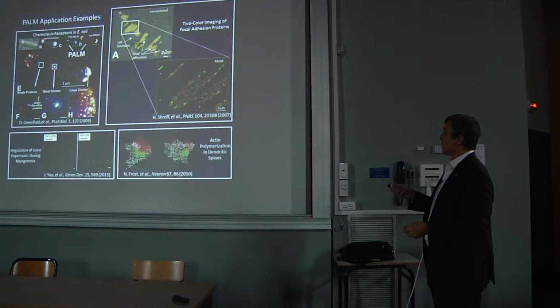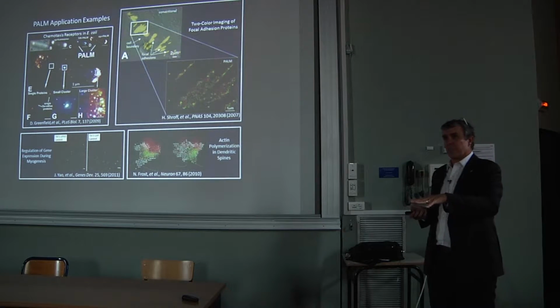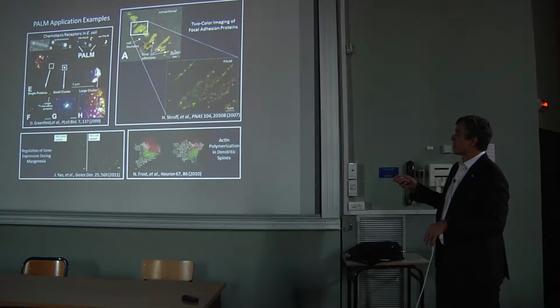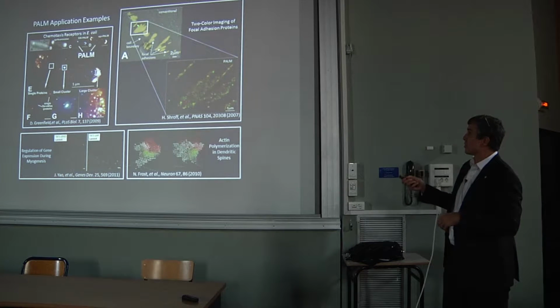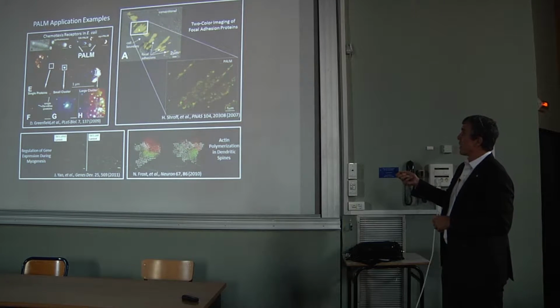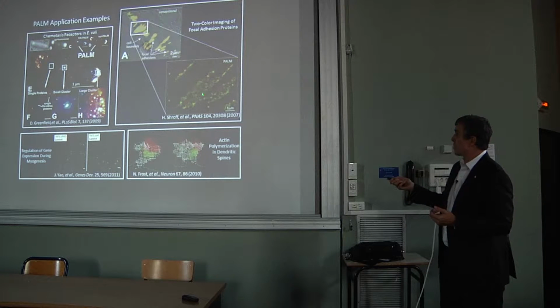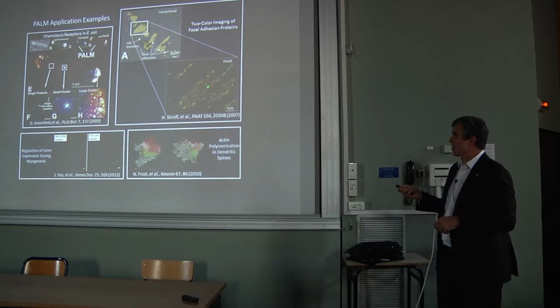Here we looked at focal adhesions, which are the points of contact of the cell to the extracellular matrix, and so kind of the feet of the cell. And there's about 90 different proteins in these focal adhesions, but in this case we were looking at a pair, vinculin and paxillin, and at the diffraction limit they look like they're co-localized, but with higher resolution they form little aggregates that are spatially segregated.